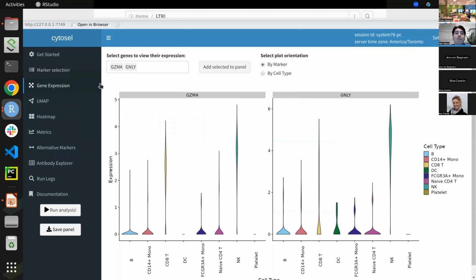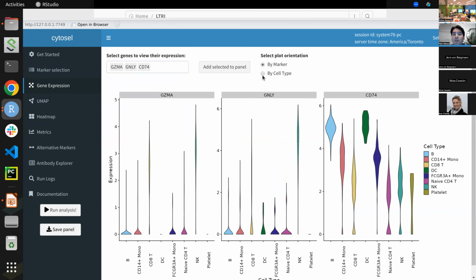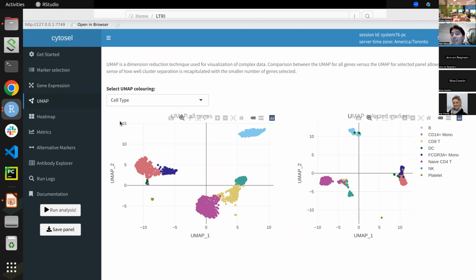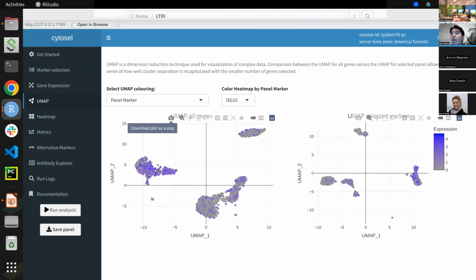They can also go to different visualization panels to be able to confirm any of the data that they may be seeing and get greater appreciation for comparison. For example, they can look at different aspects of the data set in an interactive way and really be able to use this to confirm or, like I said, question any of the preliminary results that they may find. And we've built in a variety of very typical visualizations that researchers in the biology field use that we hope they will find useful in being able to do a lot of important exploratory data analysis.